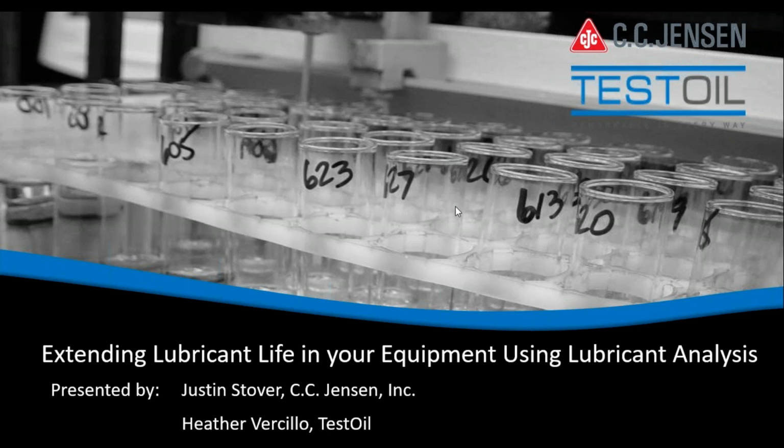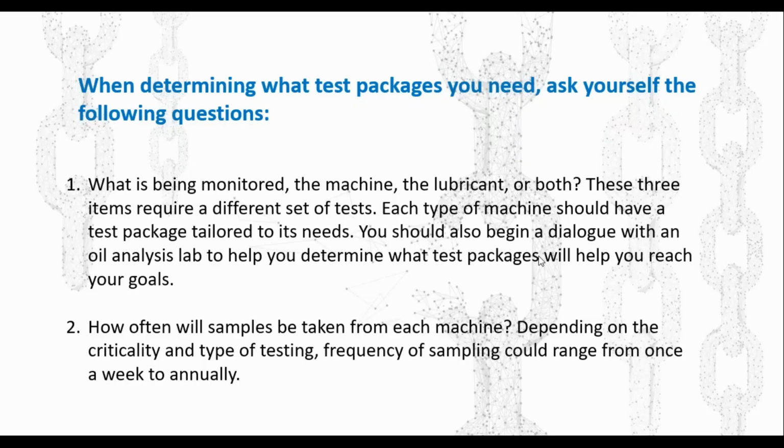Extending the lubricant life of your equipment is obviously the whole goal of why we all do this, right? We want to have uptime, maintain reliability so that we are not losing time, labor, and resources. We want to optimize all of that. One of the ways we do that is through lubricant or oil analysis. When we talk about that, there are really a couple of goals and questions we want to ask ourselves. There are really two questions to start with.